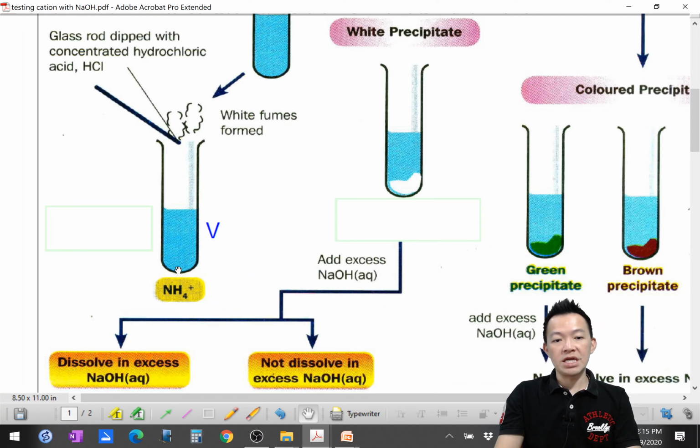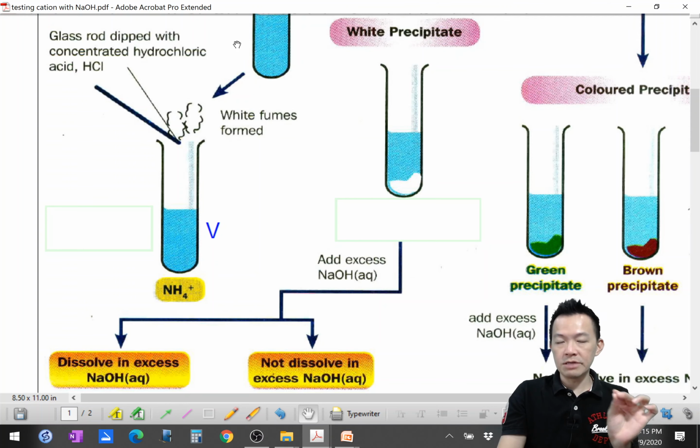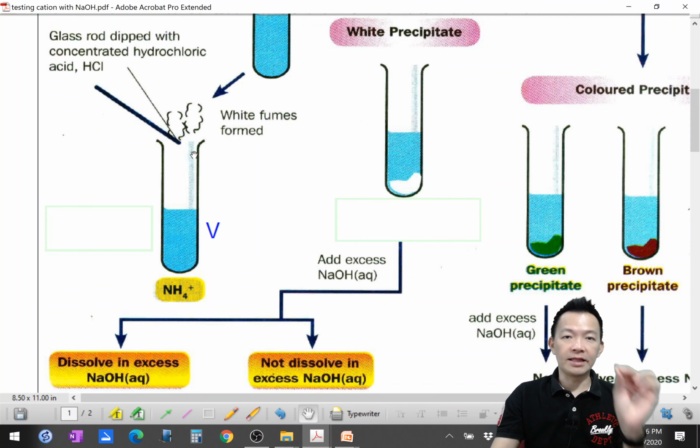So now you simply heat the salt solution. Now you heat it for a while. Okay, after you heat the solution, ammonia gas is going to be produced. To confirm this is ammonia gas, you can use the first method, the moist red litmus paper. The red moist litmus paper is going to become blue because ammonia gas is alkaline. Or maybe you can test with another one.